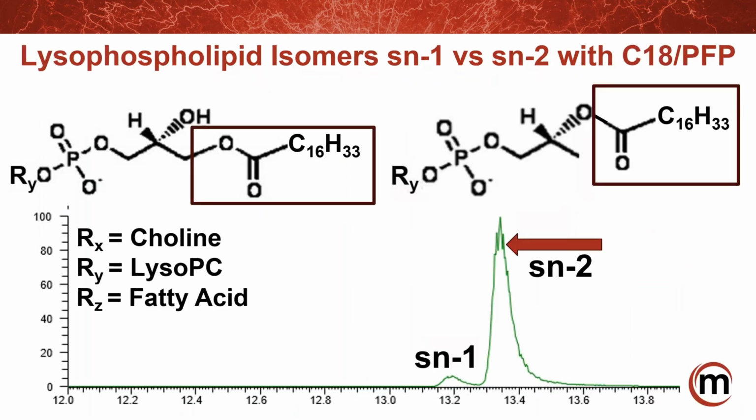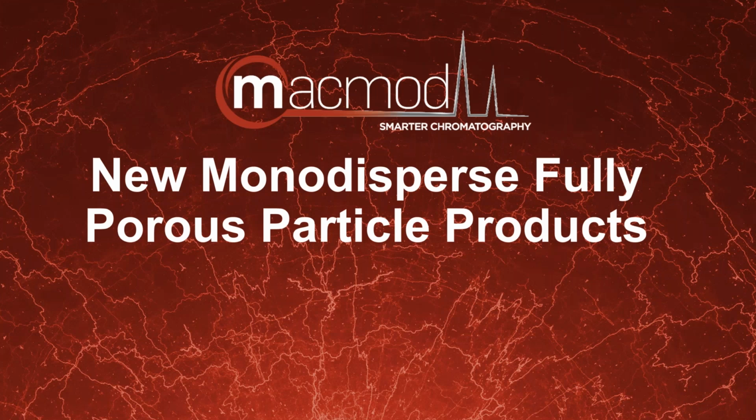And then this is another benefit in an untargeted where they want to understand the lipid character and try to get the metabolites at the same time. So here you're able to get the SN1 and SN2 lysophospholipid isomers separated, which can be beneficial because this could lead to other disease states that they like to know about or like to at least get a hint at what the doctors can treat. And then with that, I just wanted to talk about how we're further expanding the product portfolio.